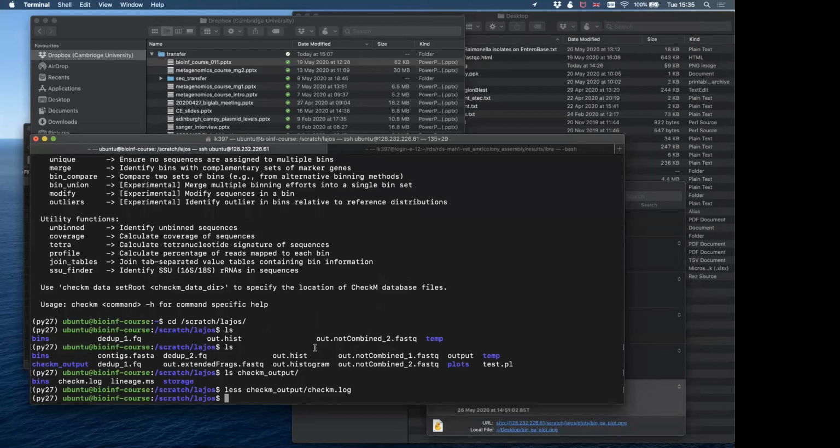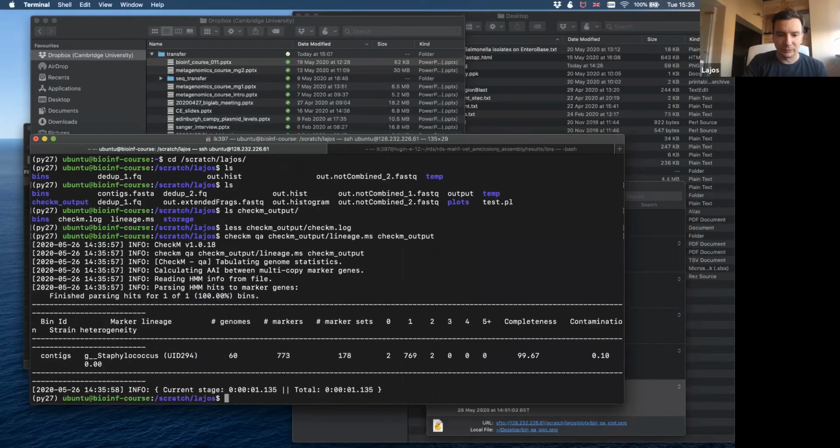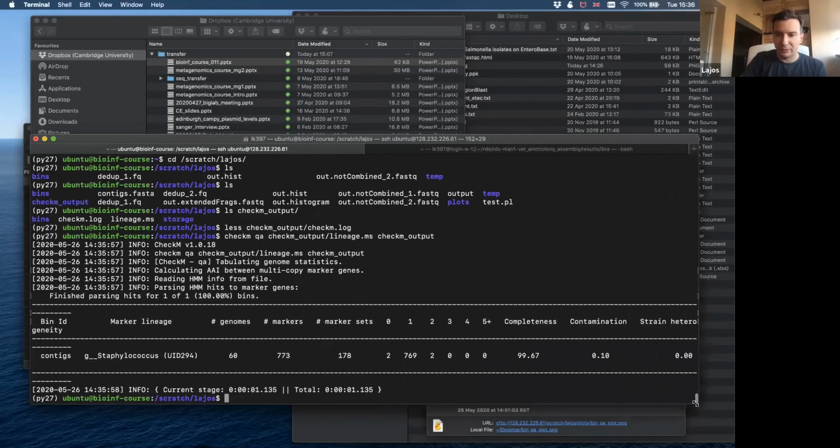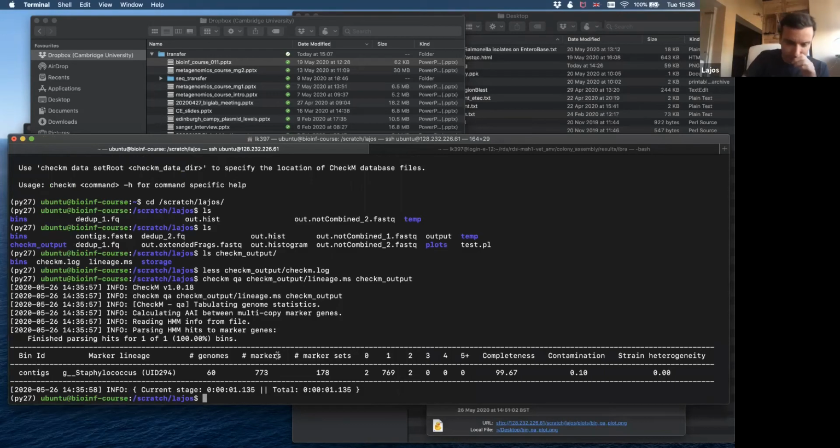Yeah, it's done. So you saw all these log files, and you also saw a very short table, a very simple summary table at the very end. It looks something like this. Let me just show you. I think it should look something like this. So this is it? Yep, it's the same. Okay. So this is what you will get.